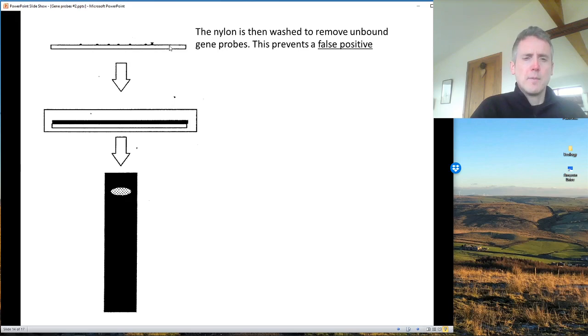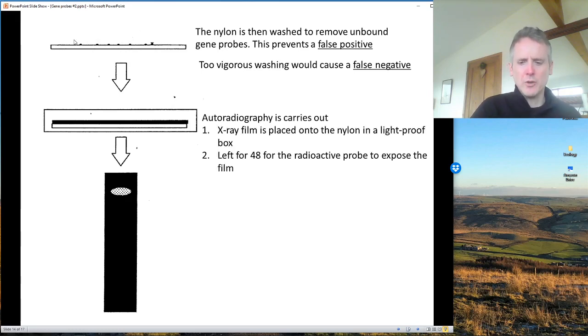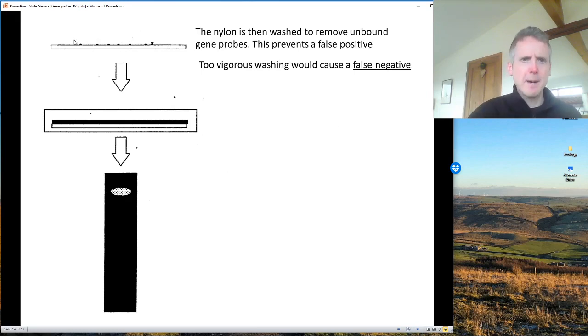So by giving it a wash, it prevents a false positive result. And a false positive result can be a nightmare. It might mean that you are probing a fetus to see if it's got a genetic condition to decide on abortion or not. And a false positive would mean you'd be facing an abortion of a potentially healthy fetus. If you washed it too much, it might give a false negative, which again, we don't want, and therefore they have machines that wash this, that follow a certain protocol. They don't rely on us washing it under a tap.